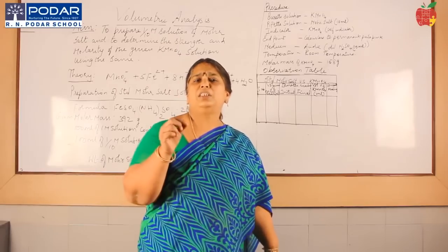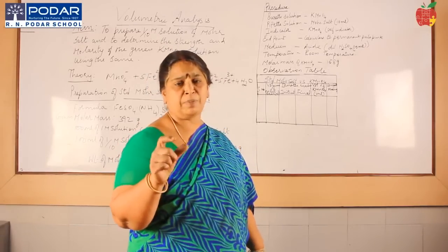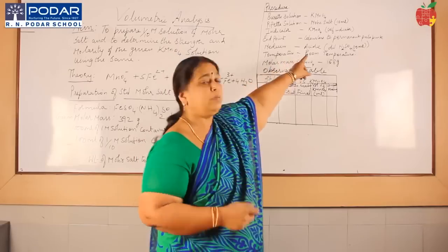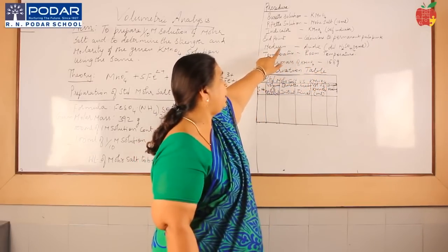Every time you add, there is a small time lag for that oxidation or the reduction that is happening. So that time lag, it will appear to be pink, but afterwards it will disappear. So till you get that permanent pale pink color, you should see that will be the end point. Pale pink color it should be.